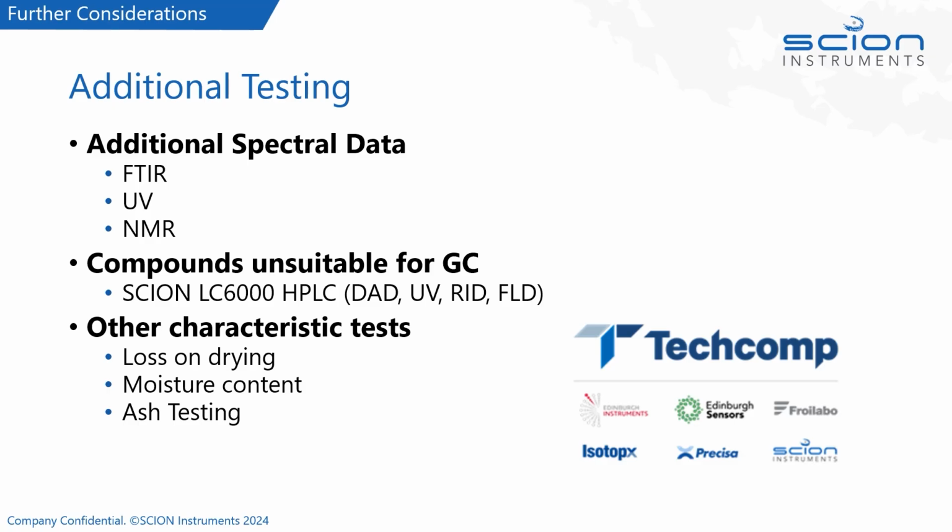This will depend on the substance that you're requiring to analyze. So it may be things like loss on drying or moisture content and ash testing.